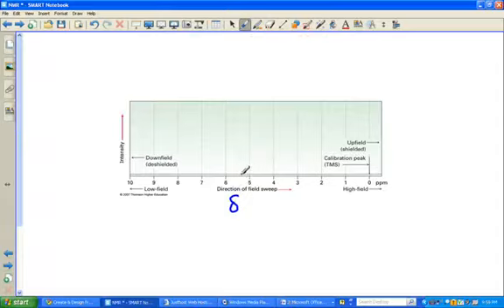The place where the peaks due to your hydrogens appear can be anywhere between 0 and 10, and the further to the left they are, the further so-called downfield they are. This means the hydrogens are closer to something electronegative, whether that's oxygen or nitrogen or sulfur or chlorine or something like that. The further to the right, the closer to 0 they are, the further away from something electronegative they are.